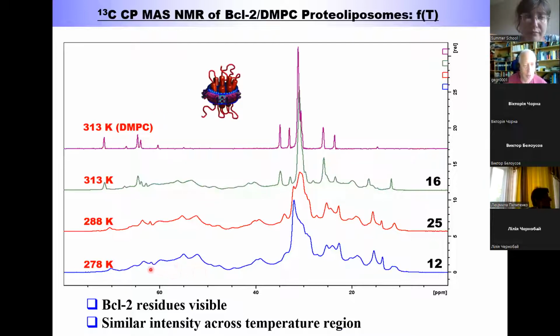You see quite a lot of residues, which are all carbon-13 labeled. They do not move, not at low temperature, not even at high temperature, only the lipids. If they melt, you see some sharp lines coming from the lipid and bilayer environment. And then you can do the opposite. This was cross-polarization, and now you make like INEPT.